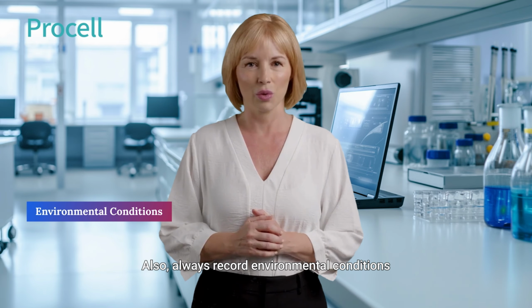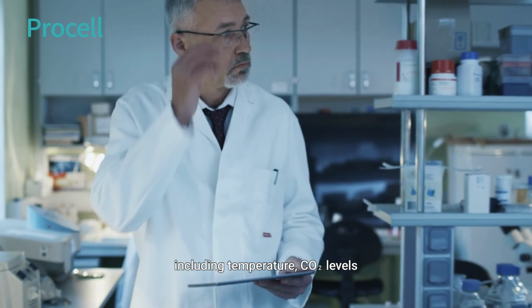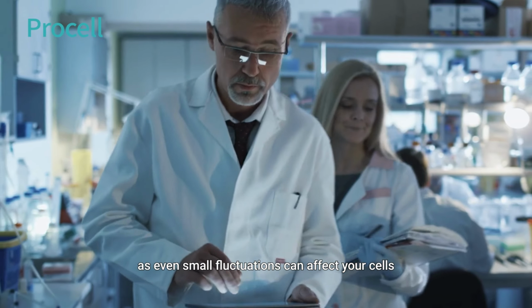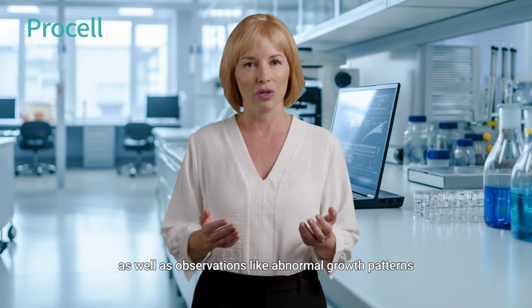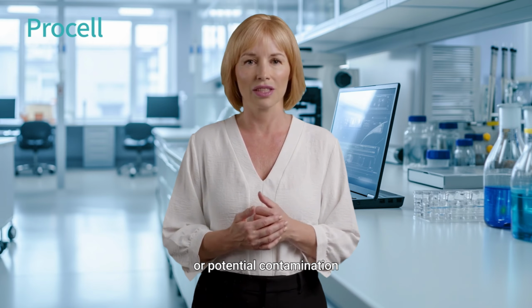Also, always record environmental conditions, including temperature, CO2 levels, and humidity inside your incubators. It's essential to monitor these factors closely, as even small fluctuations can affect your cells. Note any changes in your culture environment, as well as observations like abnormal growth patterns or changes in morphology, because these could indicate problems with the culture conditions or potential contamination.